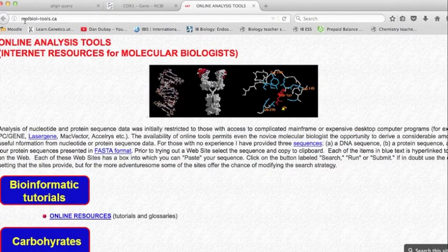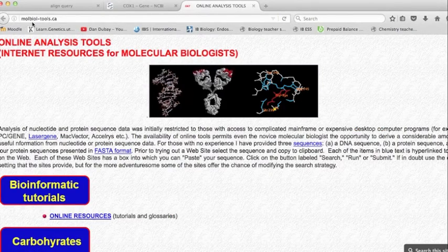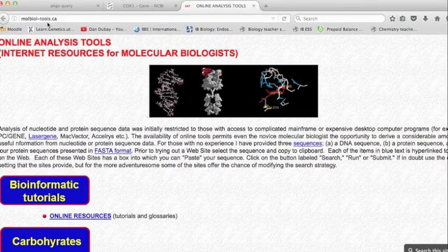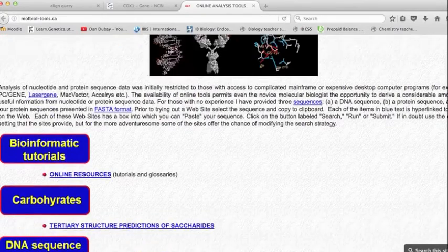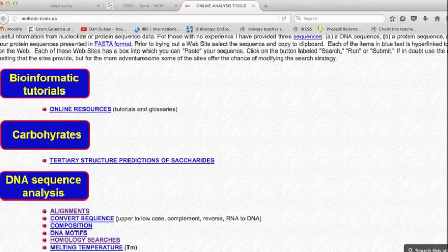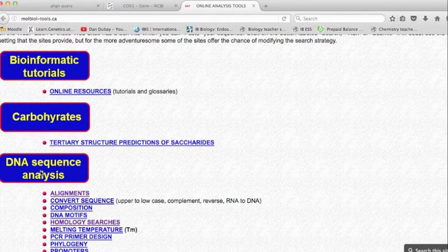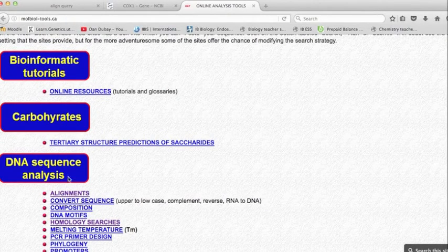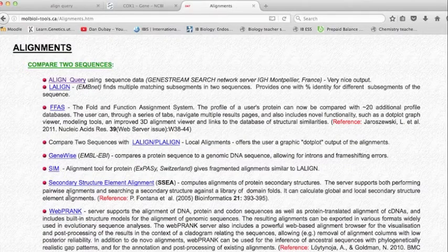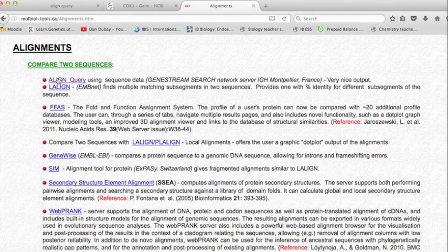Also open up online analysis tools. From DNA sequence analysis, select alignments, then select align query.